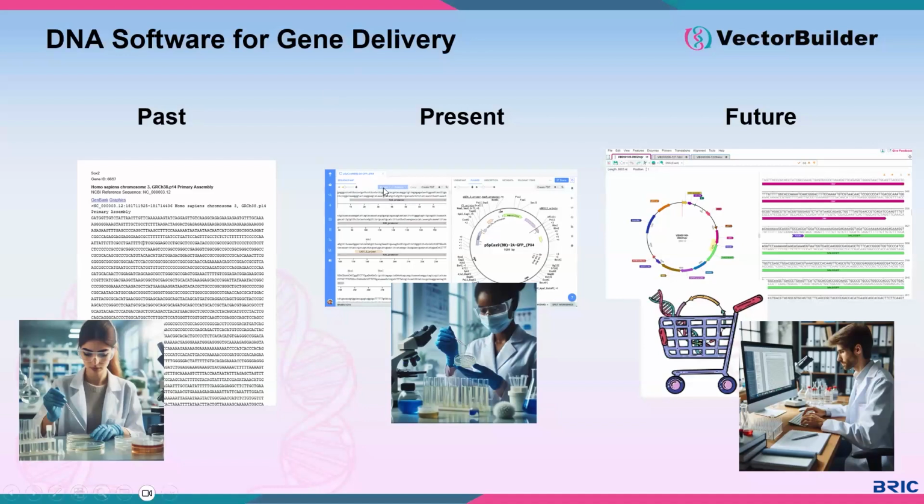Some of us may remember times when we would take large amounts of sequence data and just paste onto a Word document, spend a lot of time trying to plan cloning experiments before heading to the bench to try things out, to try to make the vectors that we needed. Now, luckily, we do have DNA software that allows for us to interact more with that sequence. So we can add things like annotations and restriction sites, but at the end of that experience, we still only have a plan. We still have to go to the bench in order to make those vectors a reality.